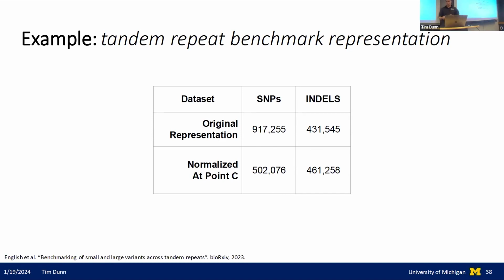So these parameters are very important in the representation, especially in complex or repetitive areas of the genome, where there is more likely to be a combination of insertions and deletions. Because you have these long repetitive elements, those insertions or deletions could happen anywhere along a pretty large range. And then it becomes more likely that they interfere with other SNPs and variants. So for this data set, we found there was a huge impact.